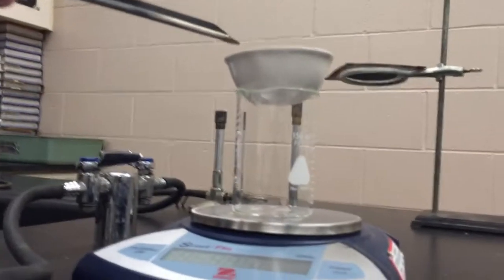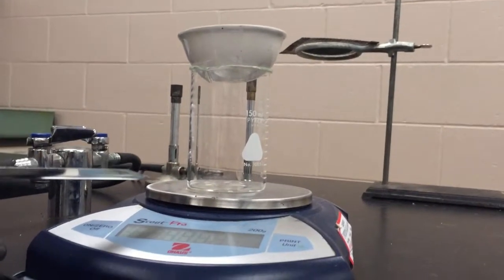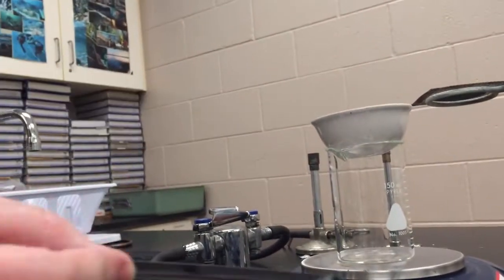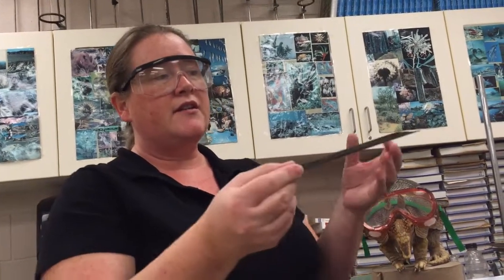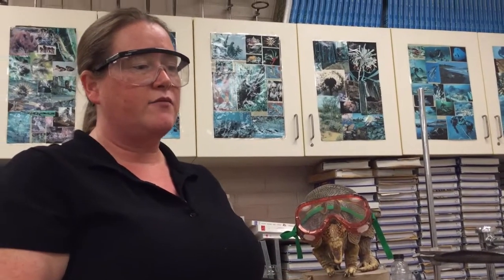The reason I have it sitting on top of a beaker is because I'm going to continually heat this evaporating dish, and it's going to get warm. You don't ever want to put a very warm object onto an electronic balance. It doesn't matter that I have the mass of the evaporating dish here. We're looking at relative changes. So if the contents inside that evaporating dish get lighter, we will see a decrease in mass. If it gets heavier, we'll see an increase in mass, and if it stays the same, we'll see it staying the same.